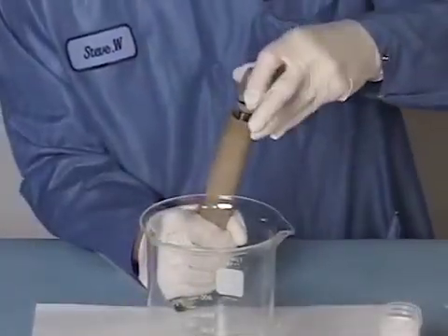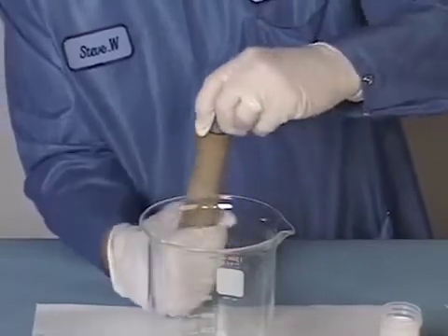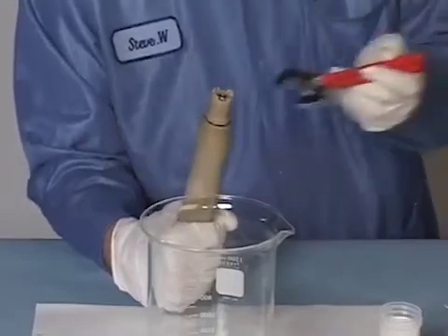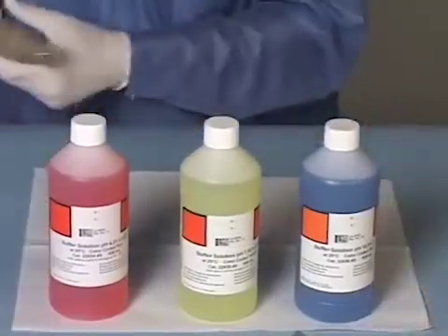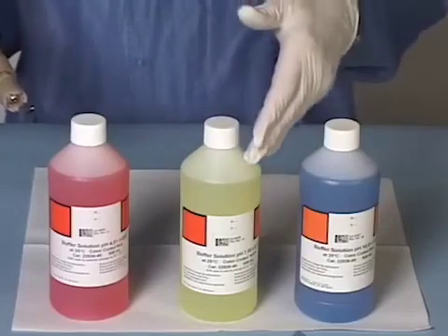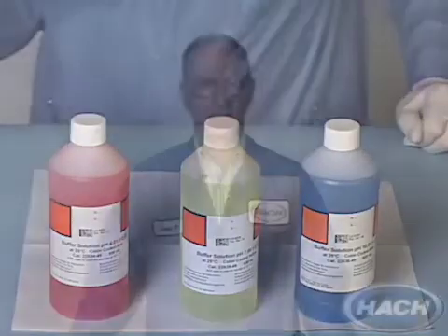Install the new salt bridge, threading carefully and screwing clockwise. Tighten the salt bridge to a firm hand tighten, then make a half turn using your crescent wrench. After replacing the salt bridge, it is critical to recalibrate the probe with 4, 7, and 10 buffer solutions to ensure accurate performance. Hawk recommends salt bridge and buffer solution replacement every 12 months.